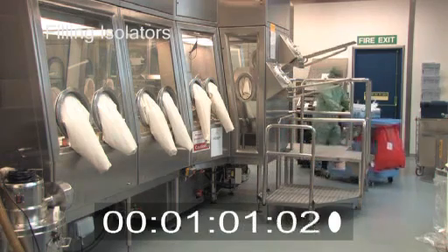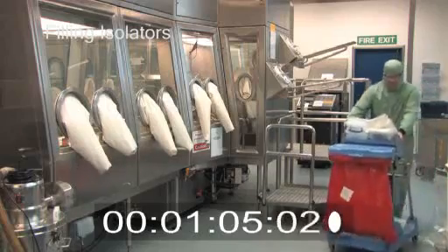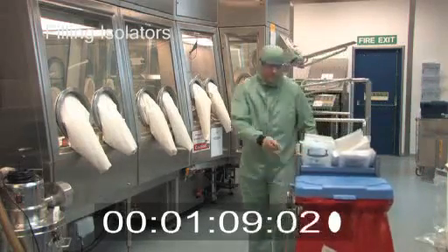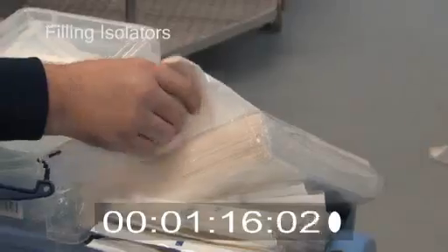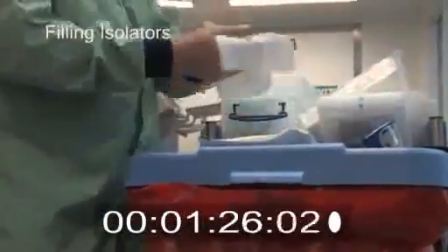Isolators used in the filling process include the autoclave isolators as well as the filling machine isolators. Each of these isolators must be cleaned thoroughly, as even though they are sanitised after cleaning using a VHP cycle, the efficiency of the sanitisation will be affected if the isolator is not cleaned correctly. The process flow and all the key points and techniques that must be followed each time are highlighted in this following film.